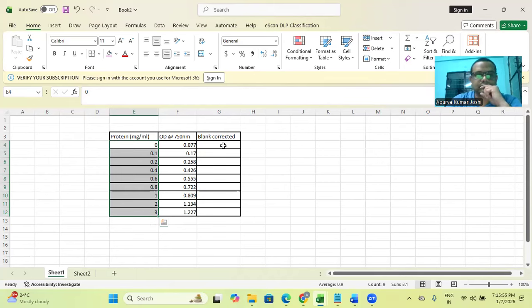I mean, especially if you're looking at a spectrophotometer, then you would often do an auto zero where a blank is taken. Blank is the entire assay reagent except the analyte being analyzed. It is used to set the spectrophotometer at an absorbance value of 0 or transmittance value of 100% at a given wavelength. So I did not do that primarily because the data was acquired using a microplate reader. So the sample was placed in a microplate, and then the data was acquired.